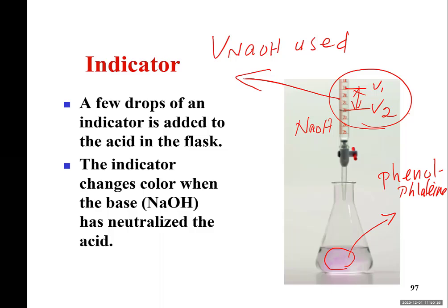What part goes up? I'm just curious for when the experiment actually happens. Does nothing go up into that part that's sticking down into the beaker? No, just droplets. Nothing goes up. So it only drops out. That's right. So you're testing how many it takes to neutralize it. That's right. Yes. I see. Thank you. Sure. Good question.